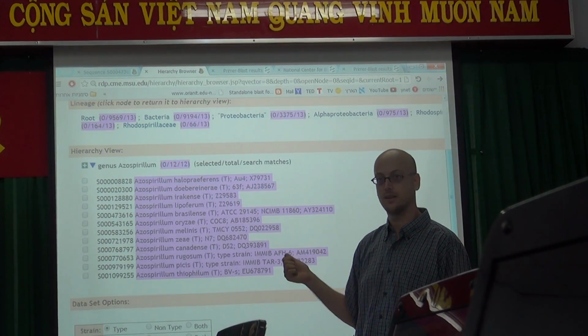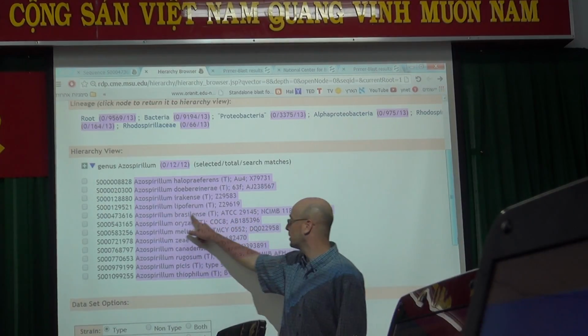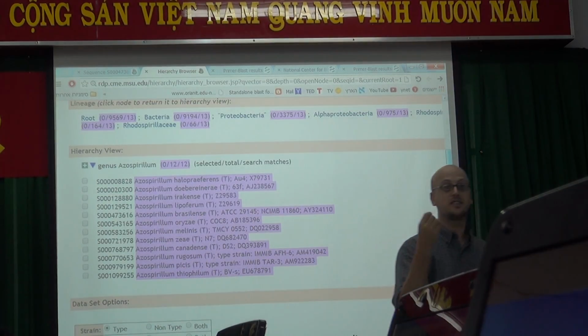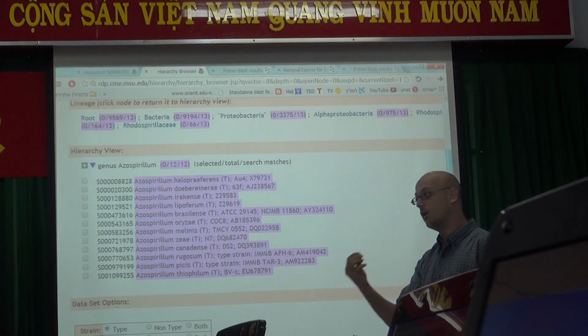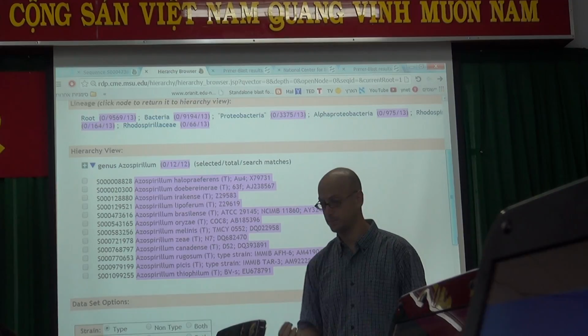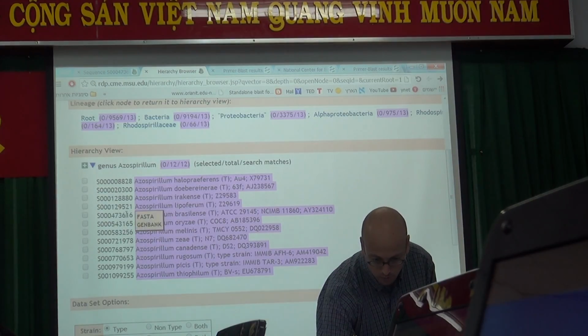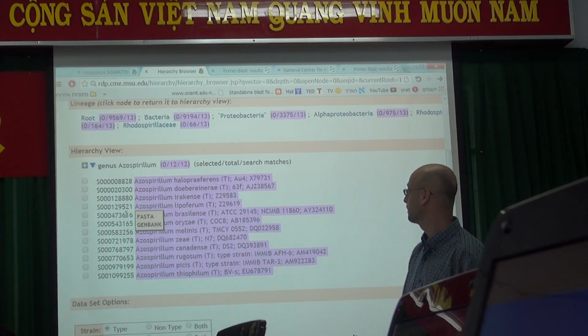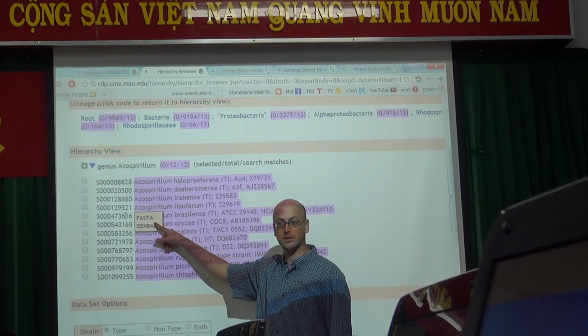Remember? Brasiliense. Very well. This one here. We want the sequence, the gene, the DNA of Azospirillum brasiliense. How do we do it? Very easily. We go here to Azospirillum brasiliense. We see here FASTA gene bank.